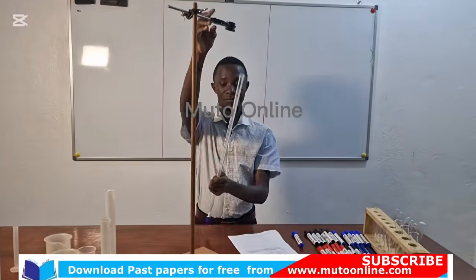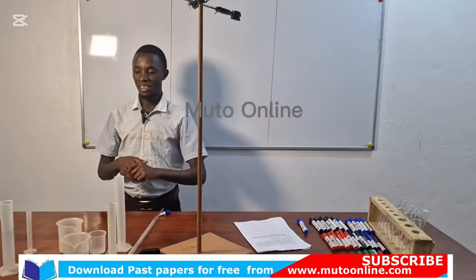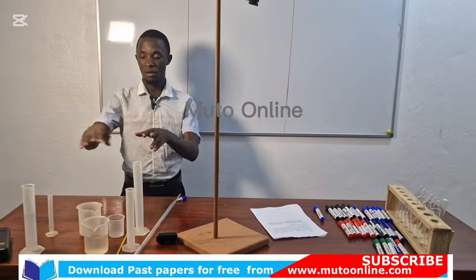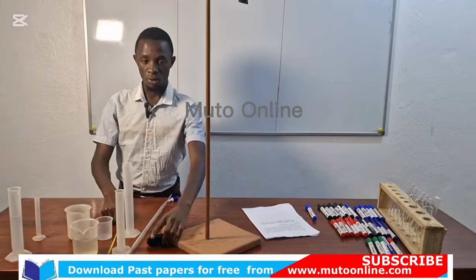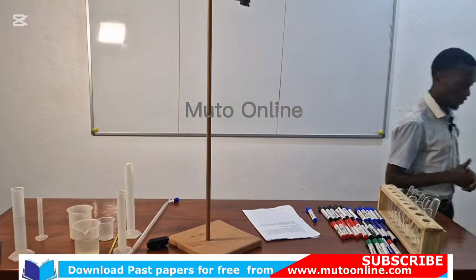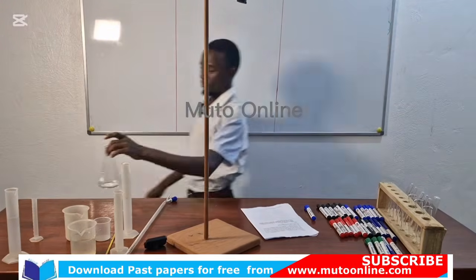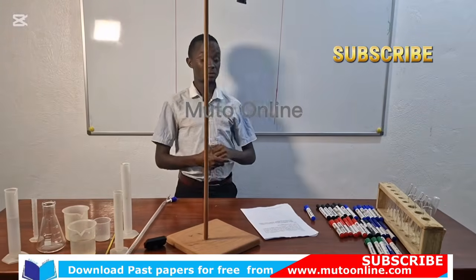A burette, a retort stand, 4 beakers of those sizes like you see them, 4 measuring cylinders like you see them, a thermometer, a stop clock or stopwatch, and 2 beakers plus a conical flask. I'd forgotten to put it there. Plus a conical flask. So we have everything the set of the item told us to provide.